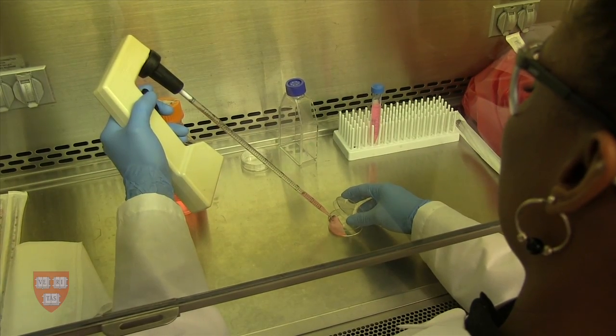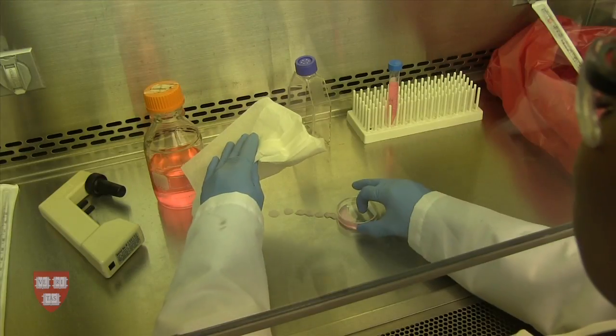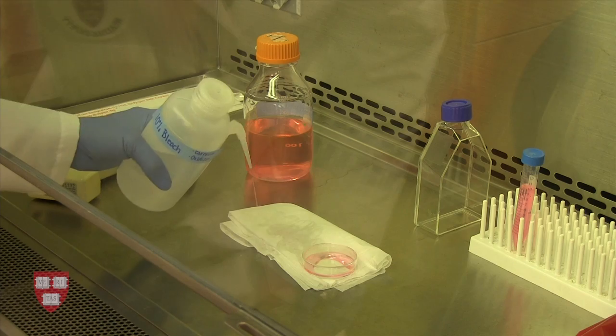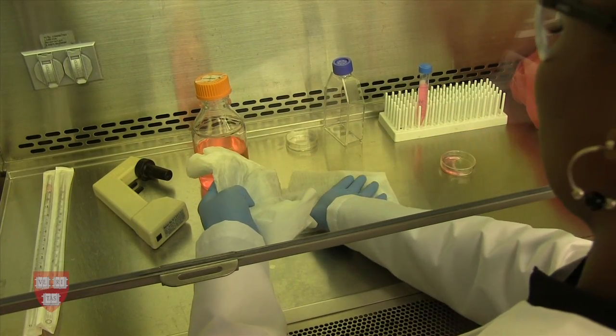If you spill anything in the hood, clean up the spill immediately to prevent cross-contamination. Stop what you are doing, cover the spill, treat with an appropriate disinfectant, and wipe up the spill. Maintaining sterile technique throughout your work in the cabinet will help your experimental results.